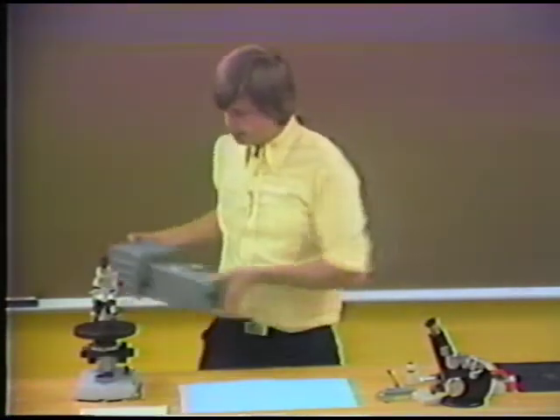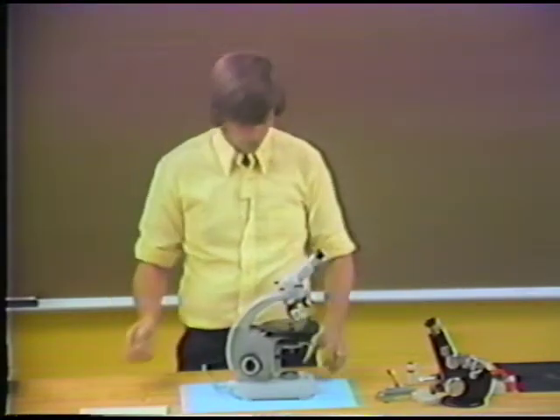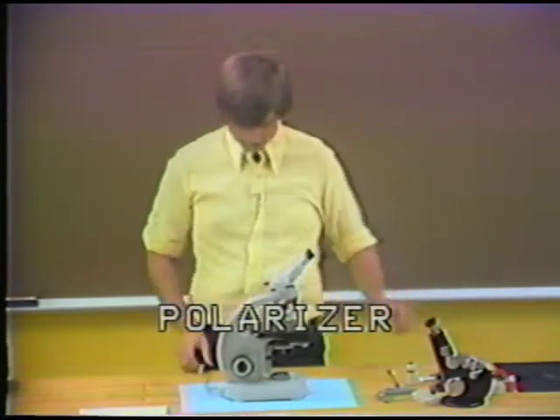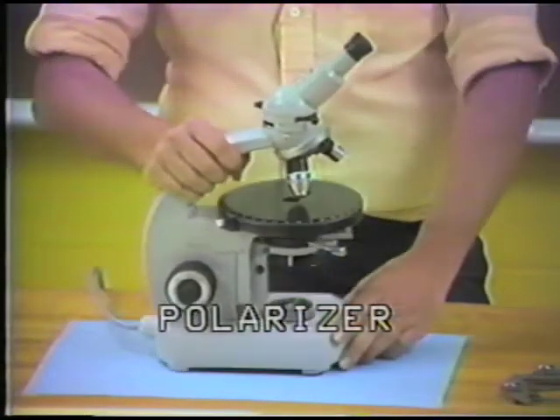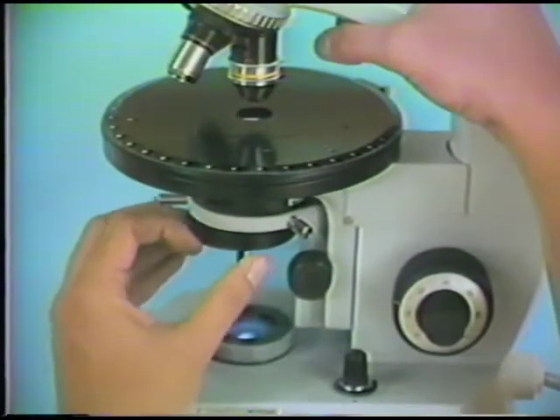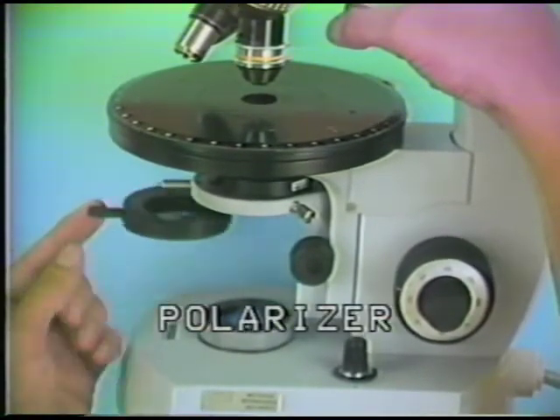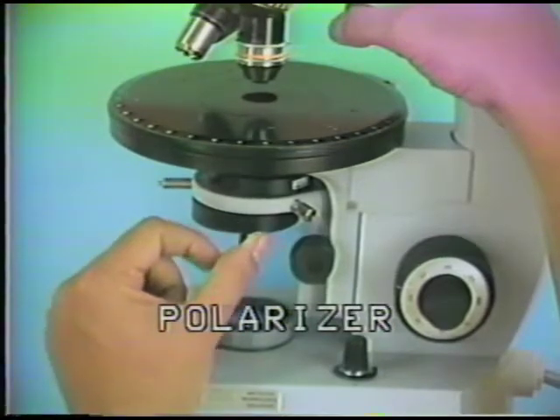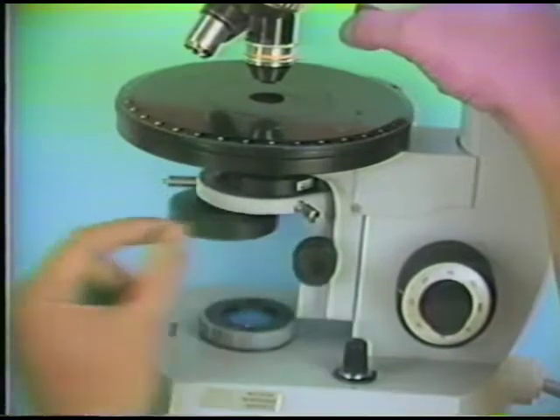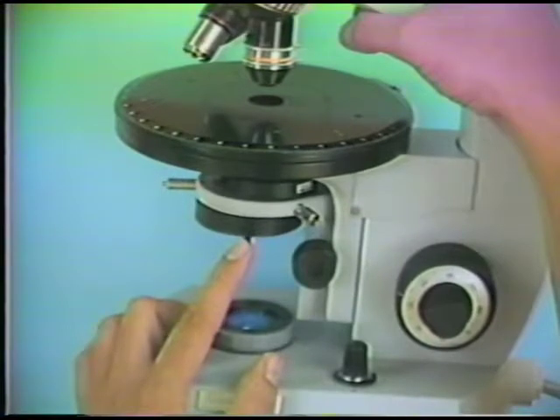Okay, I'll go back to the microscope and look at some polarizers. This is a polarizing microscope, which tells you that it has polarizers. And I'll just locate these. The first one of these is located below the stage in this position. It flips in and out, but in fact, in using the petrographic microscope, we always have this polarizer in. It's possible to remove it for cleaning, but in fact, we never look at a specimen without this polarizer present.